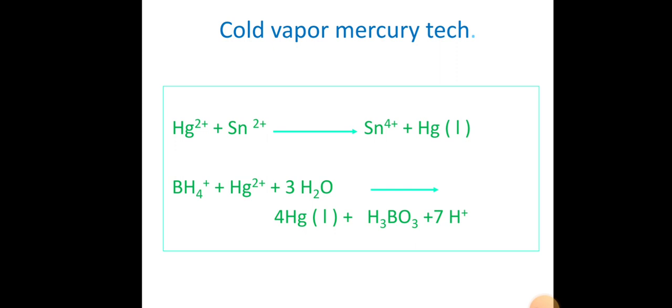For this conversion, you can either use tin Sn2+, or you can also use sodium borohydride.